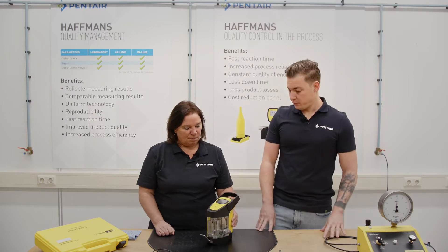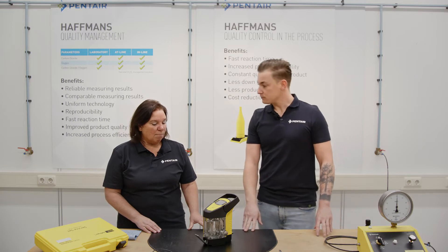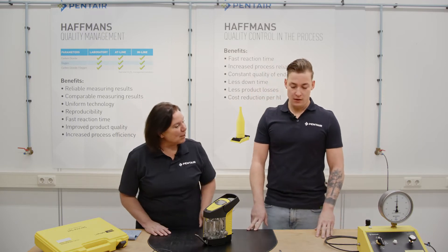And therefore it is of course important that the meter measures a correct pressure and temperature. Let's begin. How do we do that? What do we need?